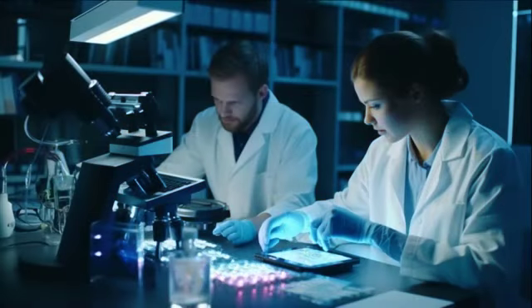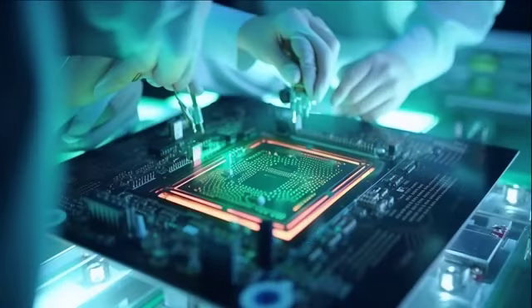Enzyme assays on Lab-on-a-Chip devices offer rapid kinetic measurements with minimal reagent use. For example, a chip can measure enzyme activity in real time by detecting product formation, similar to how a finely tuned stopwatch records the exact moment an event occurs.